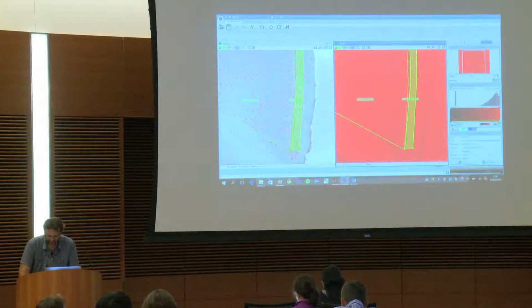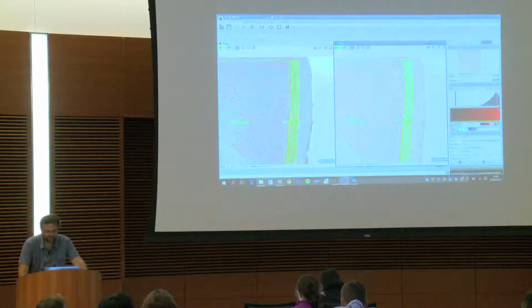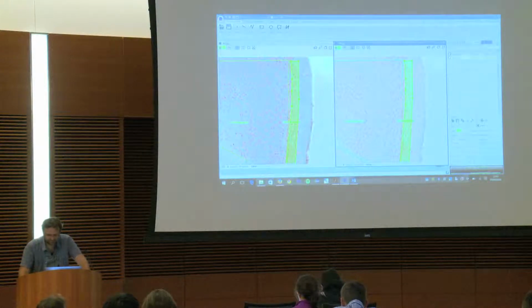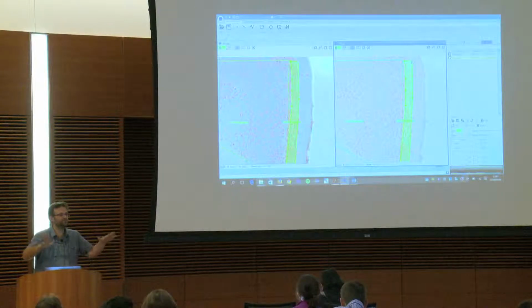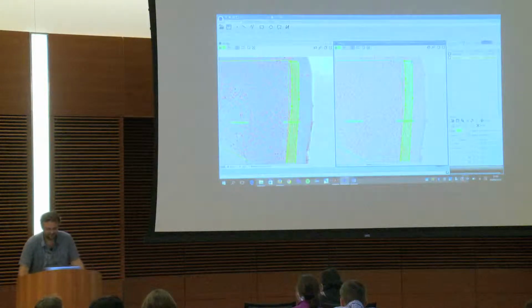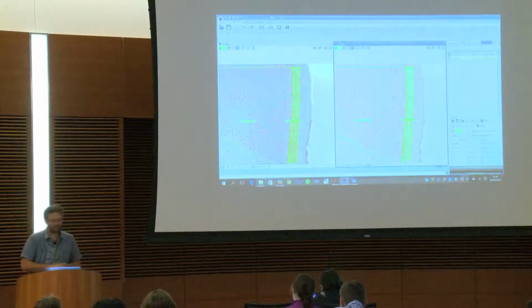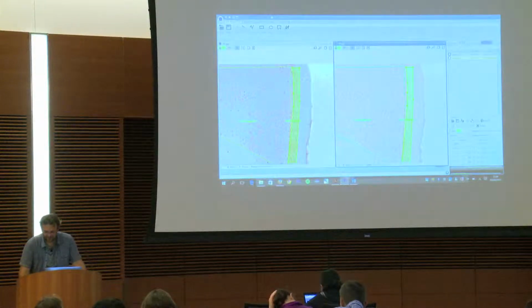Okay, so I have my two ROIs here. And by the way, you can have a lot of information just from the ROIs that are present here. Here you have the perimeter, the area, and you see that if I'm playing with this, they're updated. And in Icy, maybe you've seen that everything is smooth and everything is sent to background computation so that the graphical user interface is always fluid. So when I'm doing this, if I want to compute something big with a large area or a large number of ROIs, we don't care because everything is delayed.